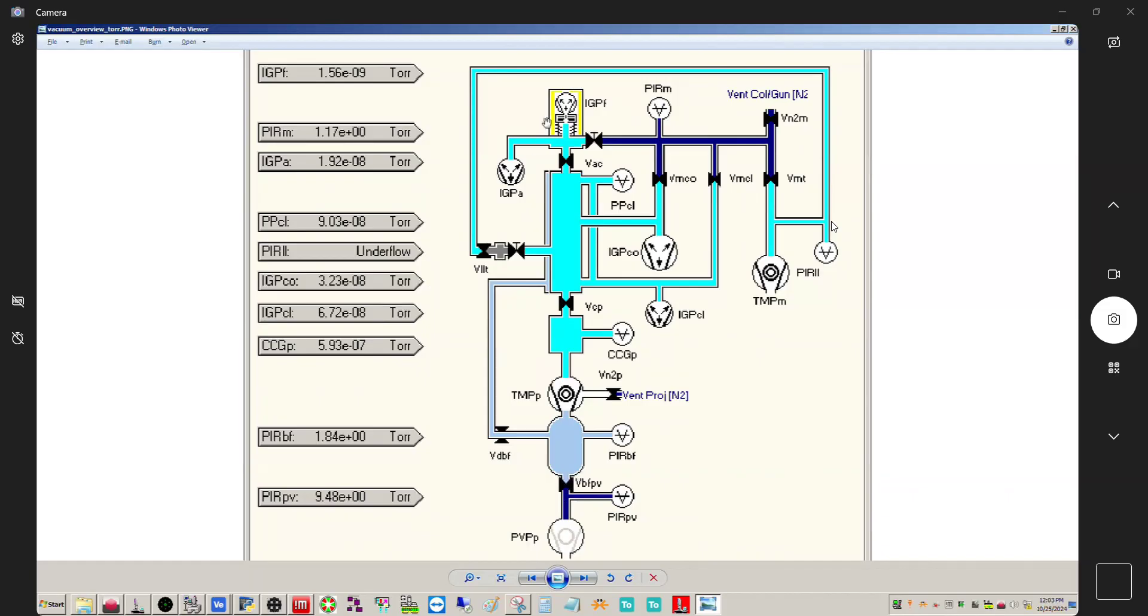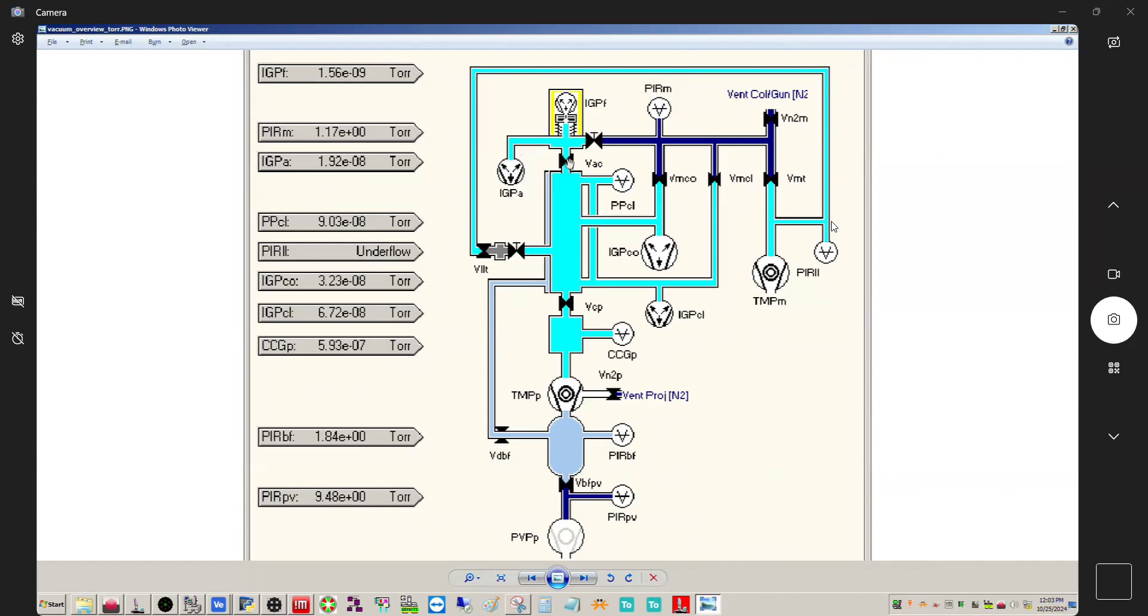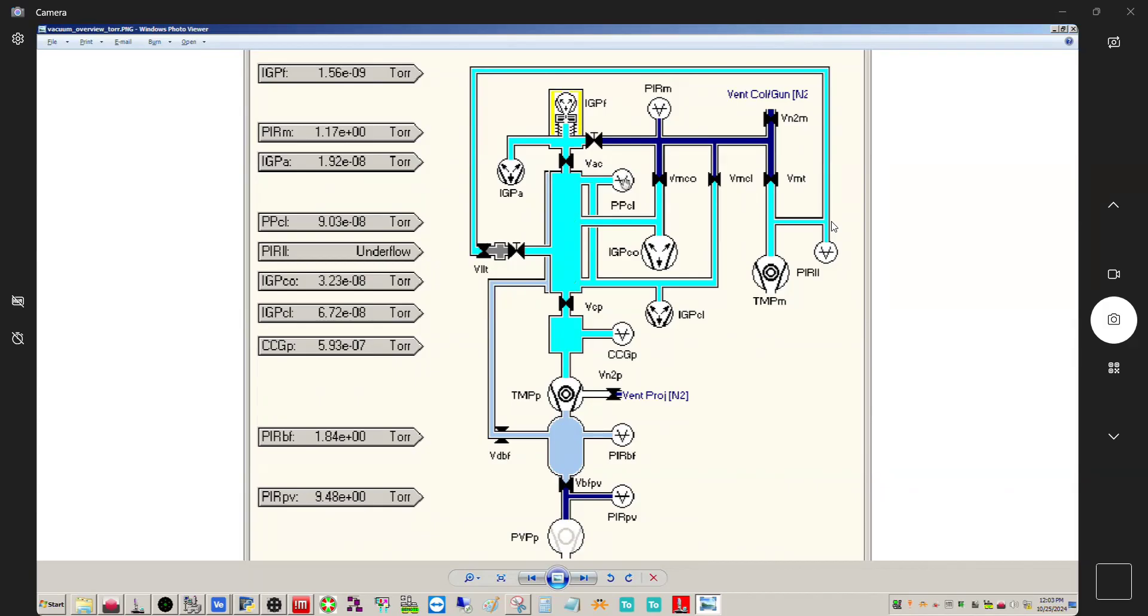So if we start up here with the FEG, we have an ion getter pump for the FEG. So after the pump, you have a small letter which denotes what it's pumping. So this is pumping the FEG area. Then you have your accelerator area and you have an IGPA for that. You then have a valve between the accelerator and the column, which is VAC. So all the valves have a capital V. And then in the column, you have three different vacuum gauges. So you have a Pirani penning gauge at the top, you have an IGP in the middle and you have an IGP on the bottom and these all pump out different parts of the column.